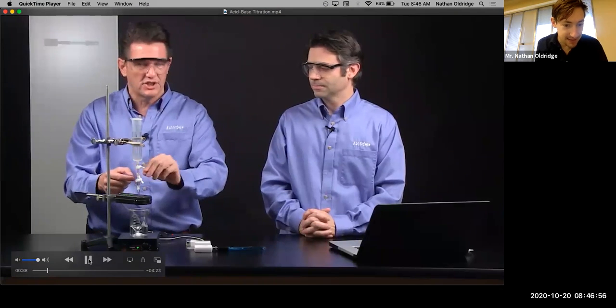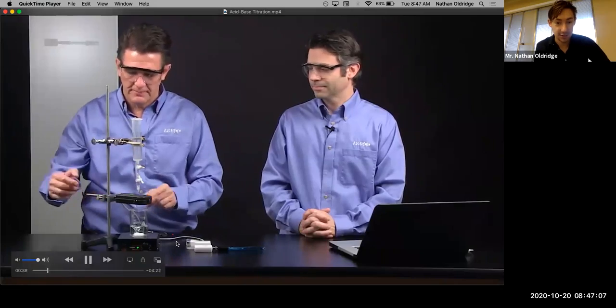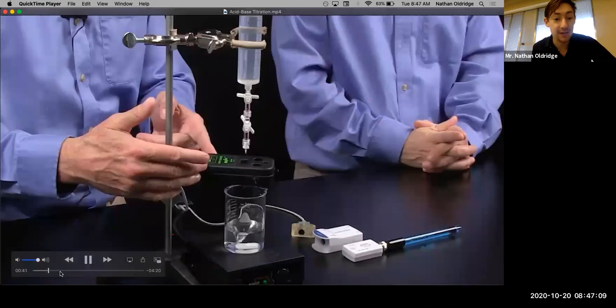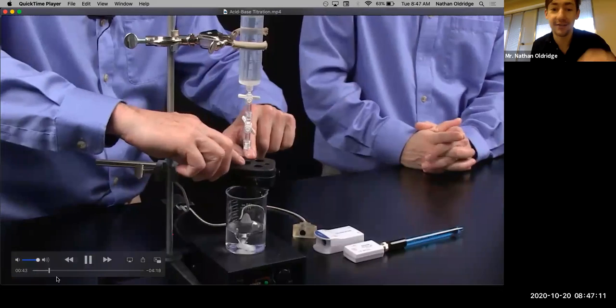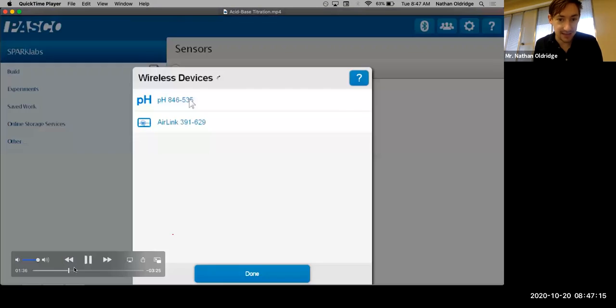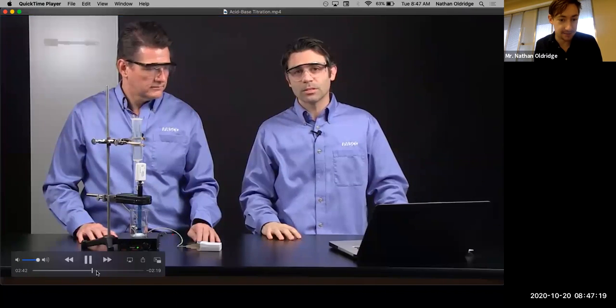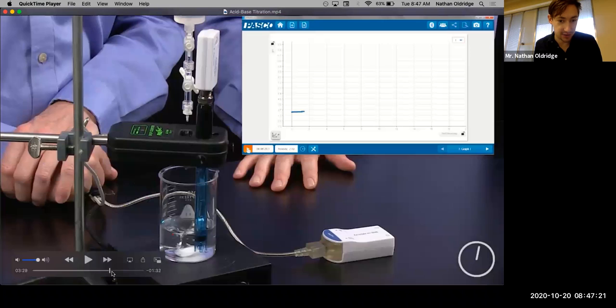So he's got basically the same setup. He's got his burette. He's got something that he's titrating down here. He's got his magnetic stirrer. But what he has in addition is a little bit of phenolphthalein, an indicator, inside of that solution. So he's just going to plug in his stuff. They're going to collect the data. Let's get that titration curve coming up.